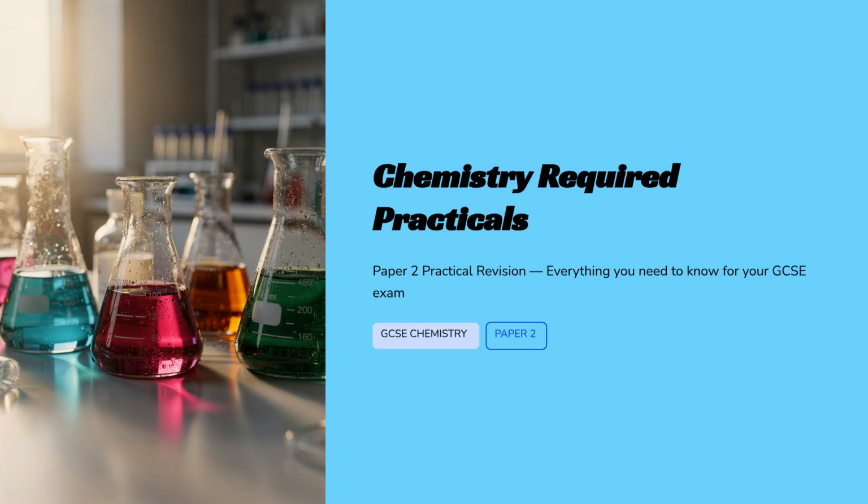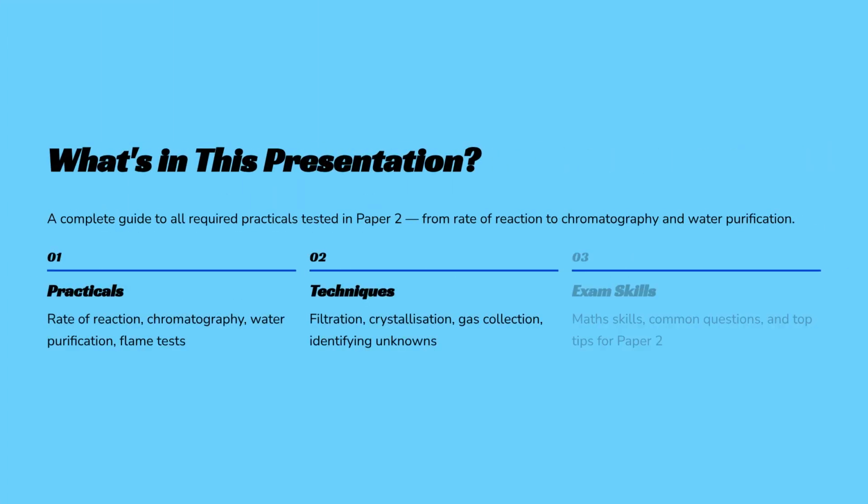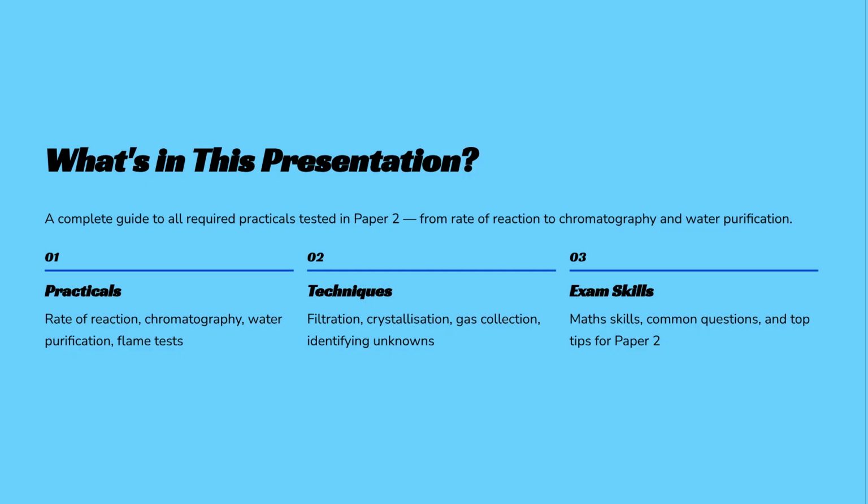Welcome to this video on chemistry required practicals for paper 2 of your GCSE exam. We'll cover everything you need to know for revision. This video is divided into 3 sections: practicals, techniques, and exam skills. We will cover the rate of reaction, chromatography, water purification, and much more.